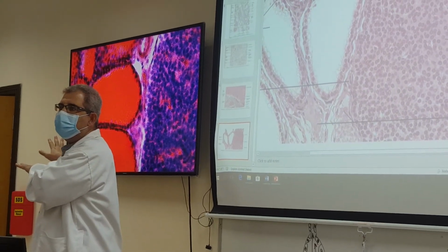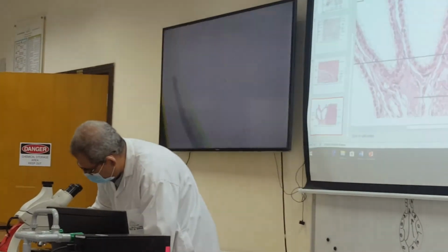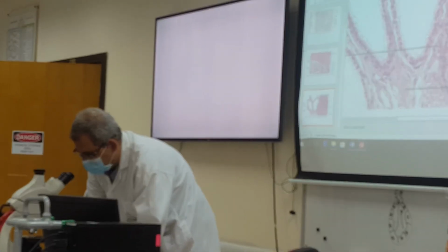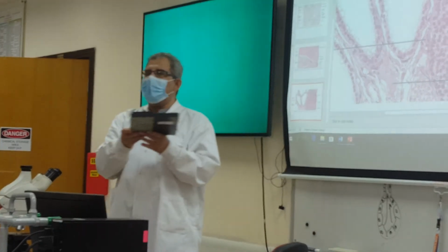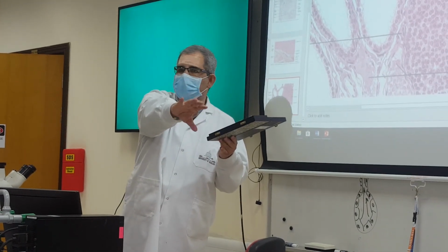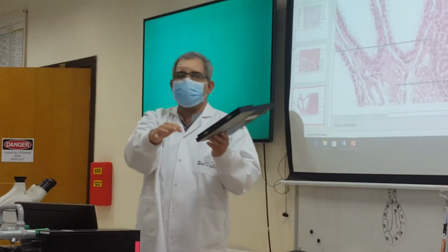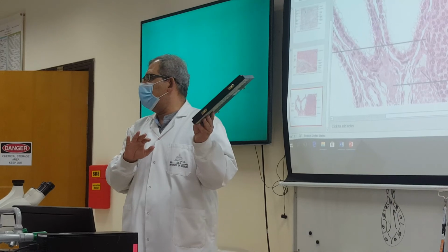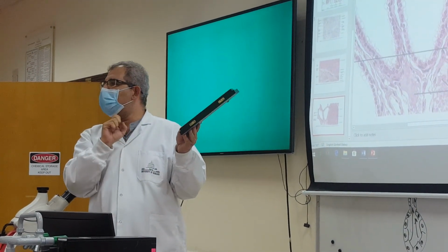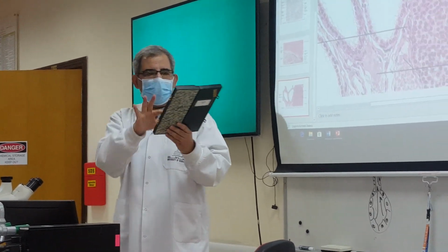Any questions, يا جماعة? So now, these are the slides. They are arranged for you. Please, just to maintain the separation and the distancing. Just when I see someone really taking a slide, I wait until they finish. I will stay away like by 1 or 2 meters. They finish, I go and take my slides. There is enough slides for all of you. It's not necessary to start with a particular slide. Okay? To identify them. Maybe you need to take a photo with your mobile phone, and by this you are done. All of them, 1, 2, 3, 4 slides.